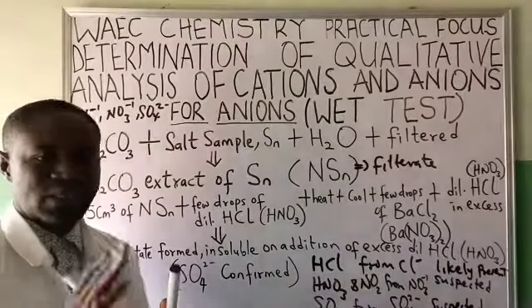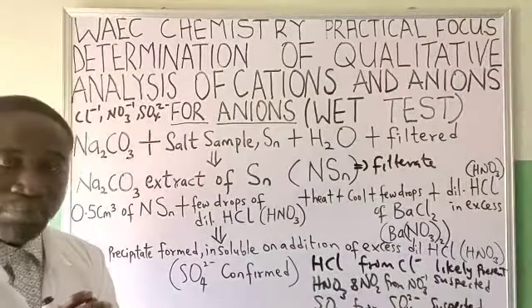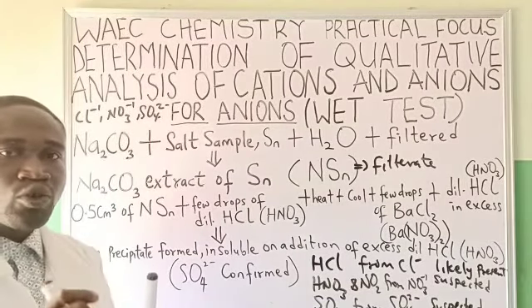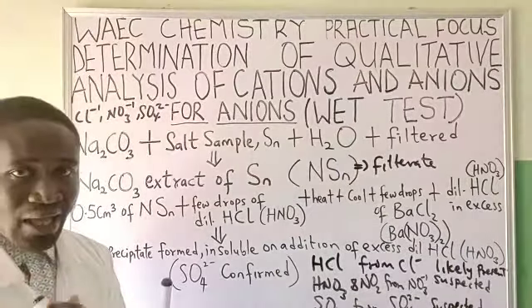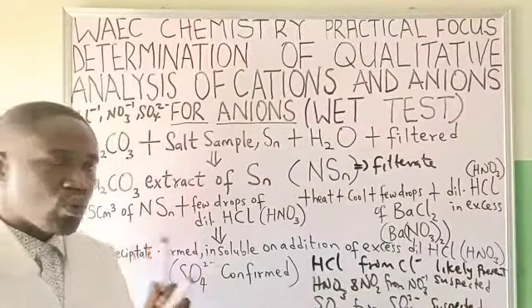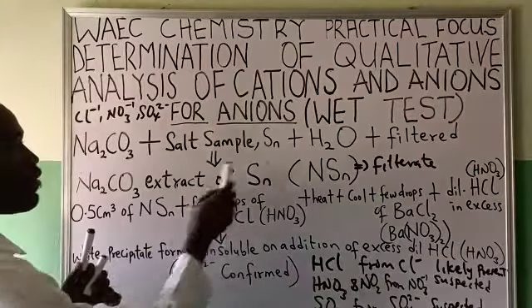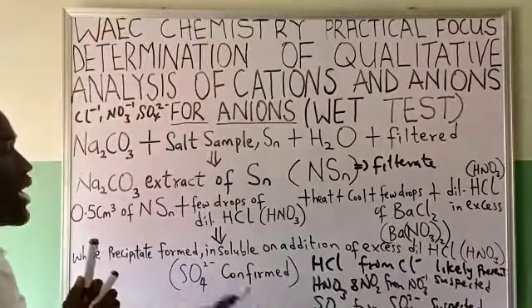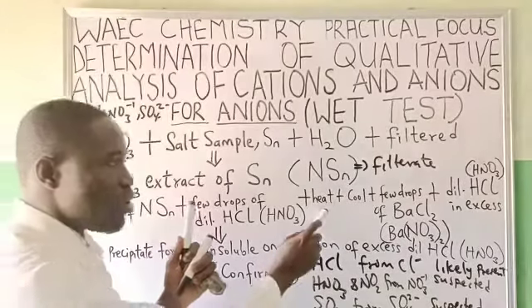Whenever a precipitate is formed, it means that an insoluble solution is formed. Please note it. Or whenever soluble solution is formed, it means there is no precipitate. Are you getting it? It is just two-way. So, I repeat, take few drops of that filtrate, add few drops of dilute HCl, heat it small.